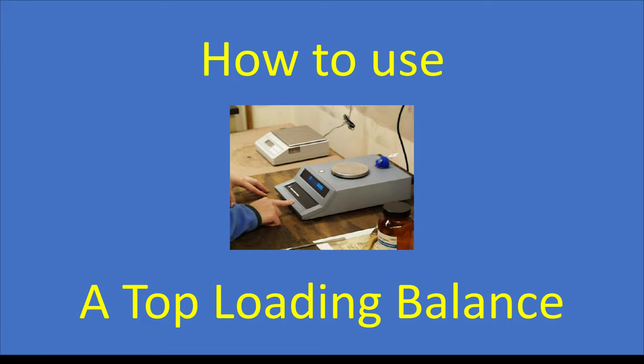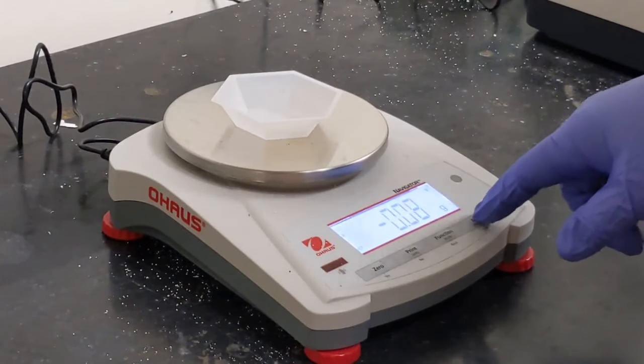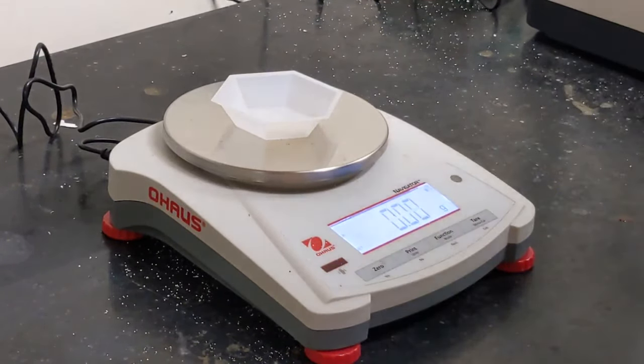In this video we will look at how to use a top loading balance. We first add our weigh boat to the balance and press the tare button to zero out the balance's mass.